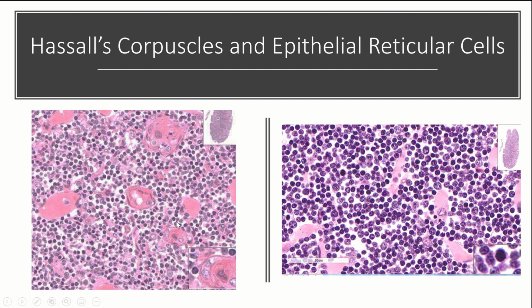So here you can see really well, more zoomed in, there's a bunch of thymocytes in here. Thymocytes basically means cell of the thymus. Basically they're those T cells forming, right? They're trying to form, and there are some other cells interspersed throughout, but the main thing we're going to focus on are these epithelial reticular cells. It's this really thick, special epithelial cell, and again, remember that it helps to create that blood thymus barrier.